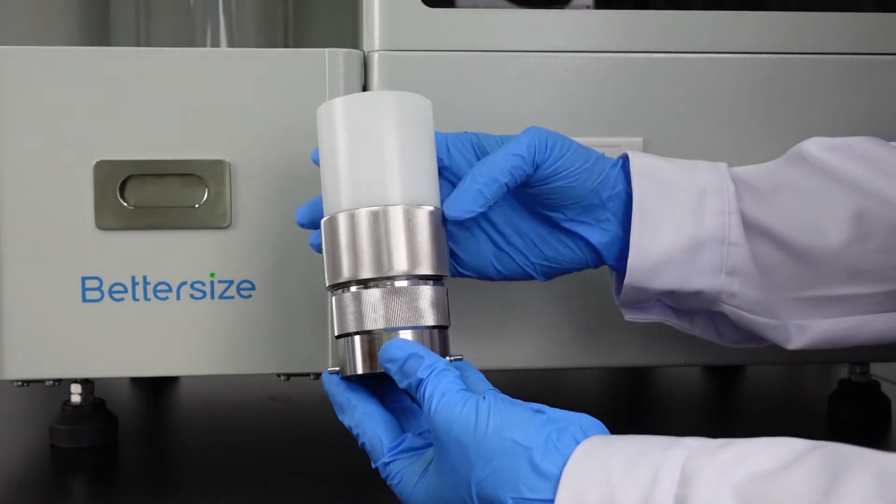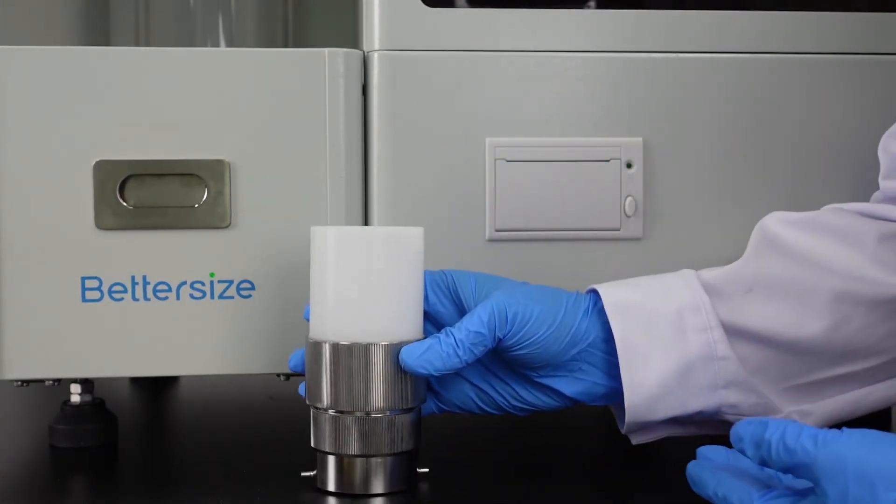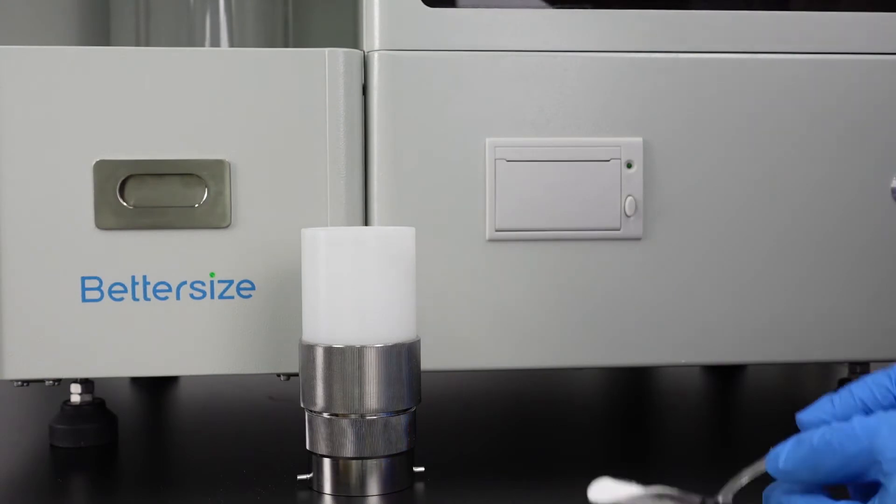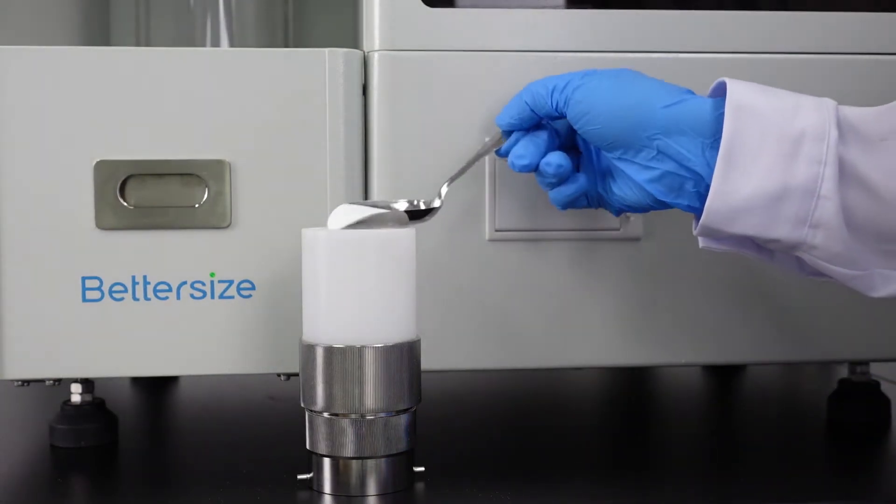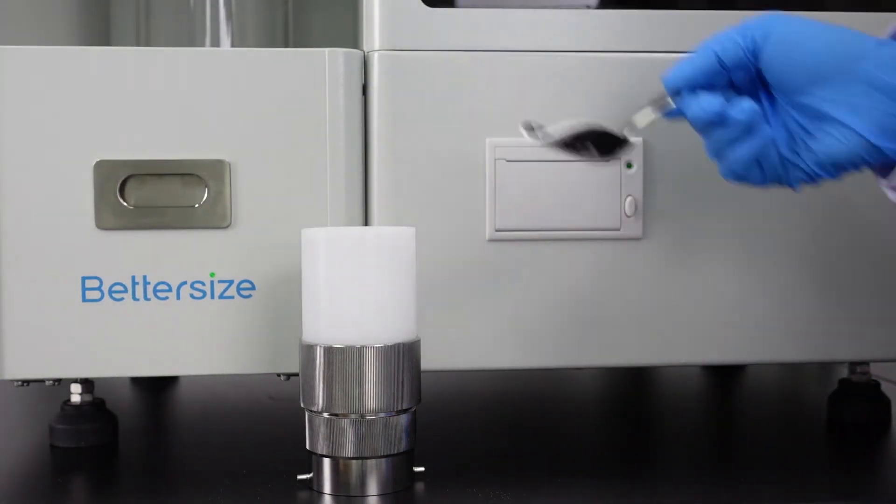Install the extension tube on a 100 ml container. Add the sample to the cylinder. The amount of sample should be more than half the height of the extension tube.